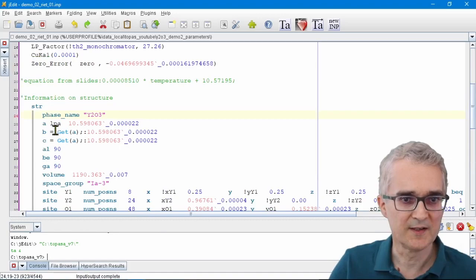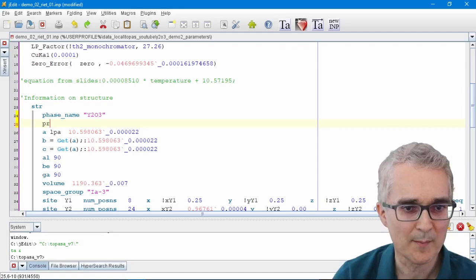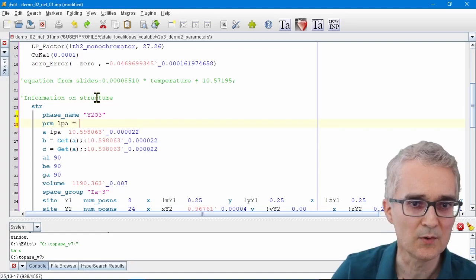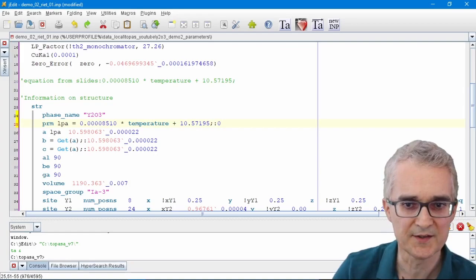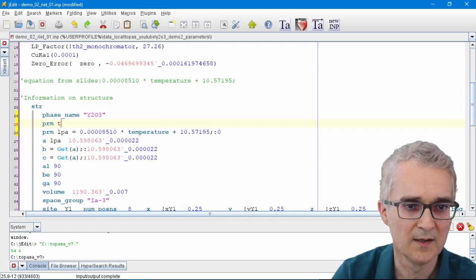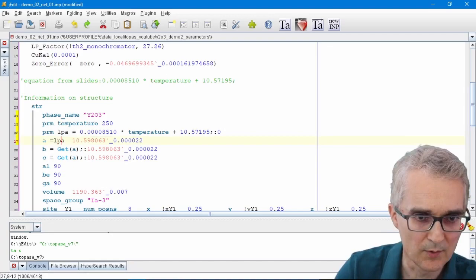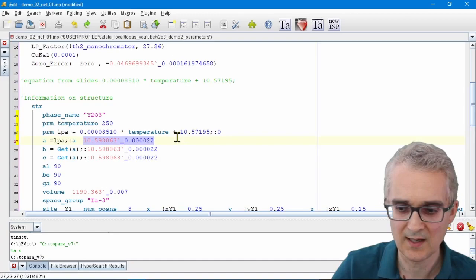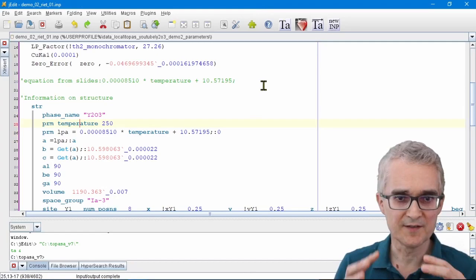Okay, so if we were trying to set up the temperature as a refined parameter, then what we will do is instead of refining the cell parameter a, what we're going to do is we're going to define a new parameter called LPA. And we're going to say that the value of the cell parameter is equal to the equation that we've just looked at in the slides. And I'll put a semicolon colon zero at the end so that the value will get updated at the end of the refinement. So temperature is, cell parameter is something times temperature plus a constant. We're going to need to define the temperature. So let's say prm temperature 250. Now the cell parameter, instead of refining that freely, we're going to set that equal to the value of LPA that we've just calculated. So now we should be set up so that the cell parameter is determined by the temperature of the measurement.